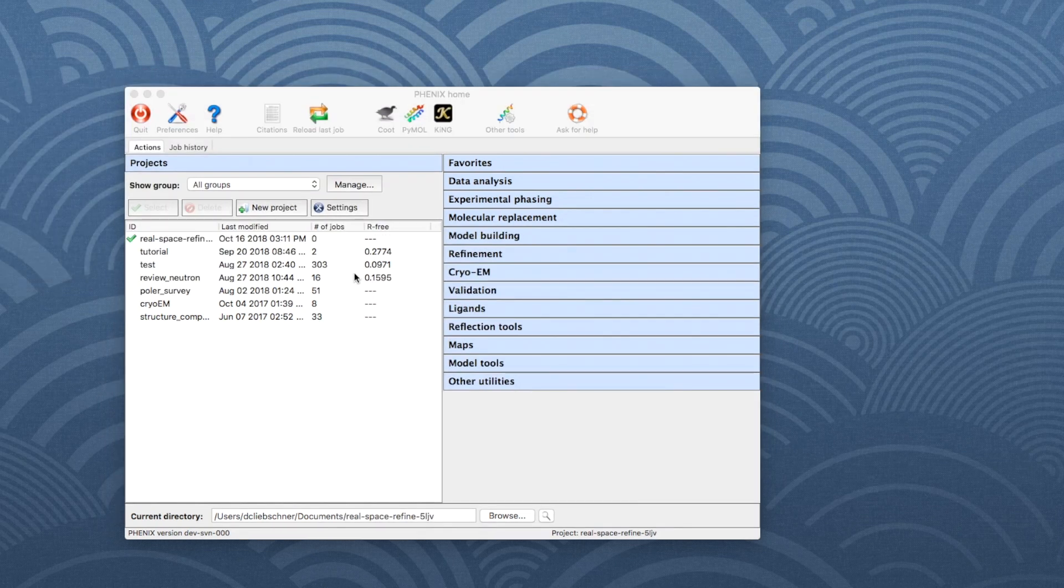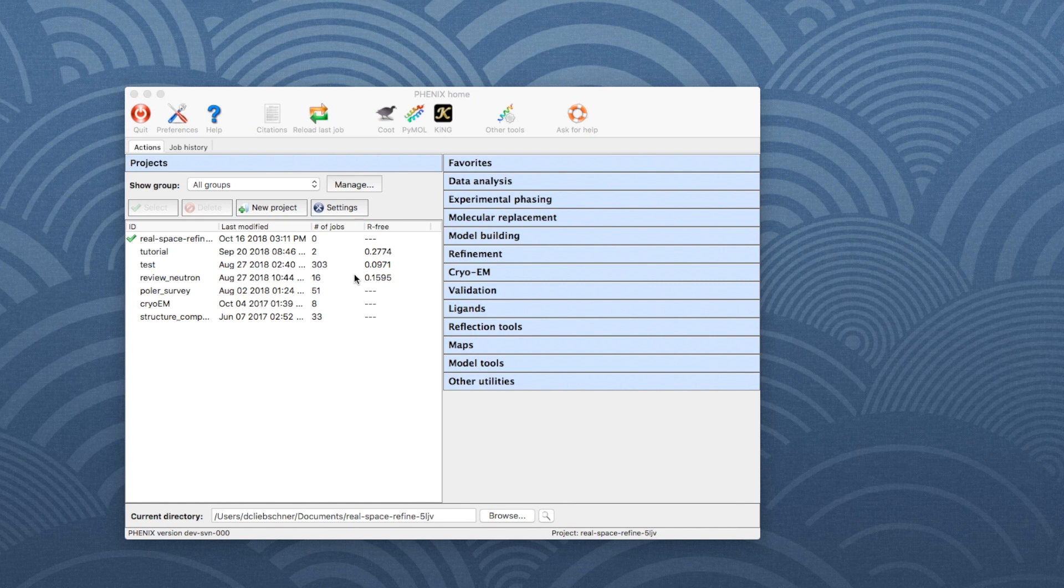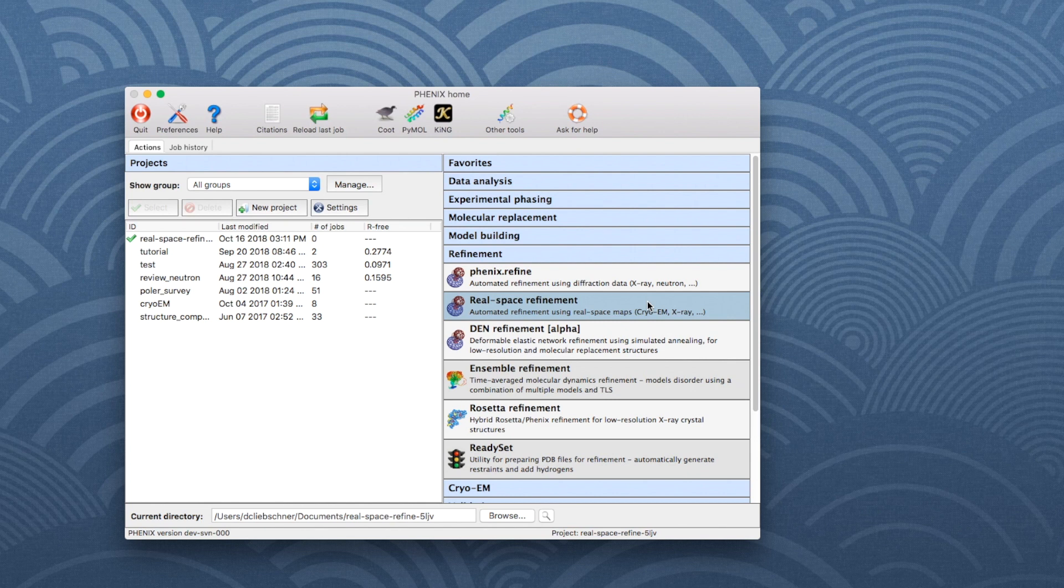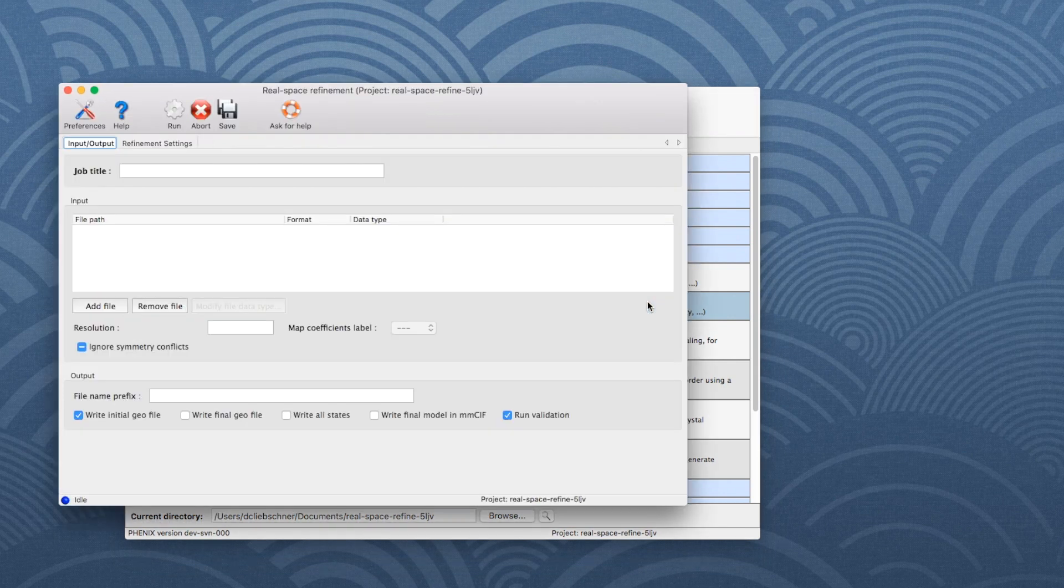To run Phoenix RealSpace Refine, open the Phoenix GUI. In the panel on the right-hand side, choose Refinement and then click on RealSpace Refinement, which opens a new window.